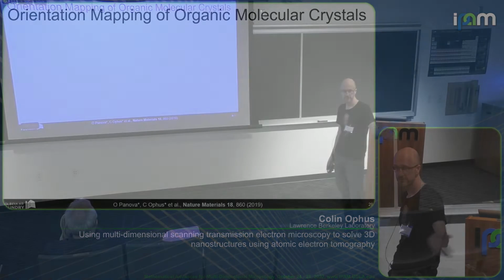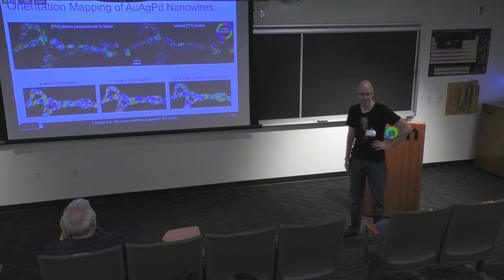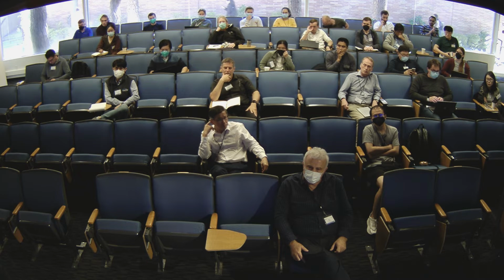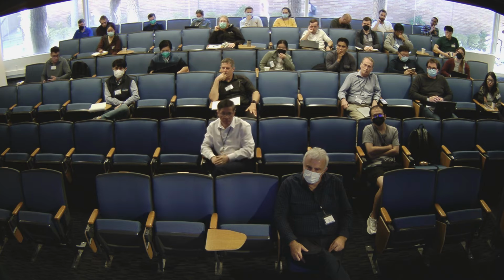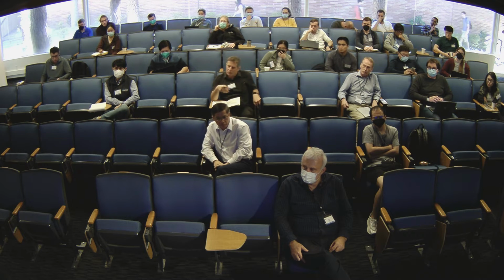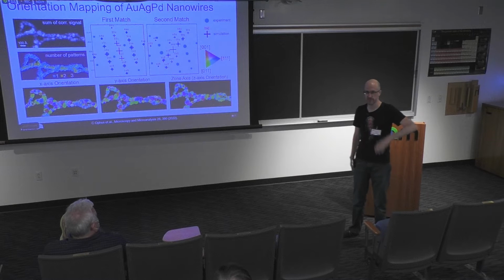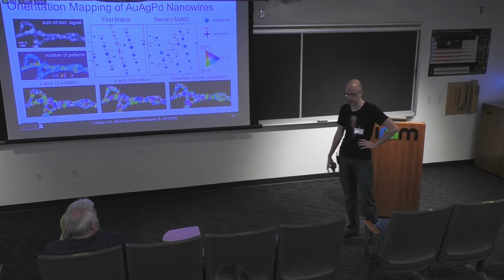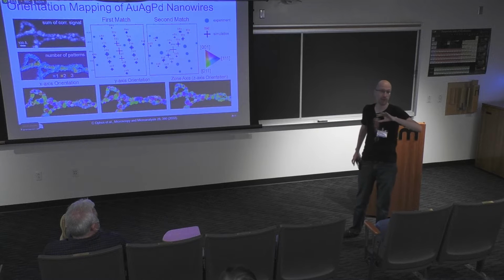Colin, go ahead. So do you have problems with ambiguous ones? A lot of times 2 diffraction patterns will look almost the same, especially if you're going down a 1-1-1 axis or... Oh yeah, we have lots of problems like that. So the ways to get around that are to do things like a tilt series, precession electron diffraction, or my group published a paper on multi-beam electron diffraction. We make 8 beams. Those beams intersect the sample at different angles, and that gives you the robustness, right?